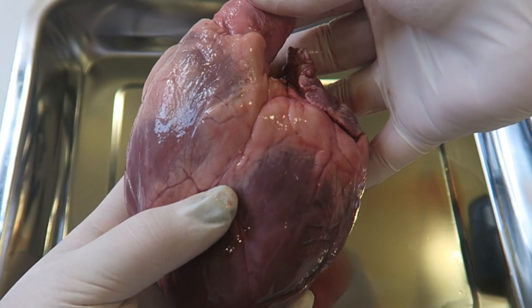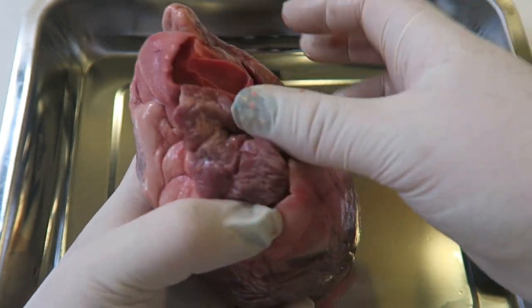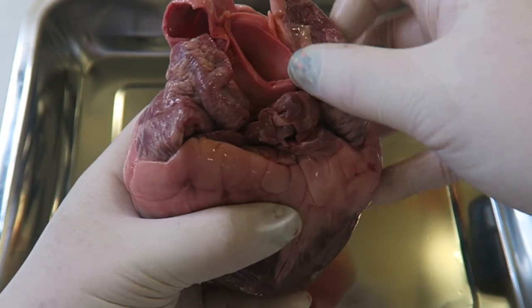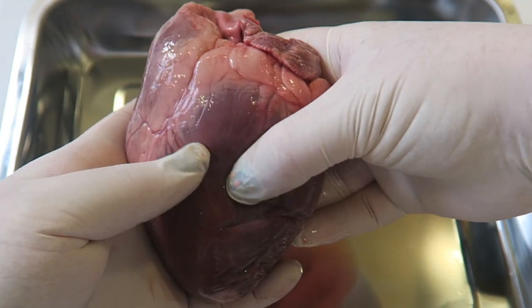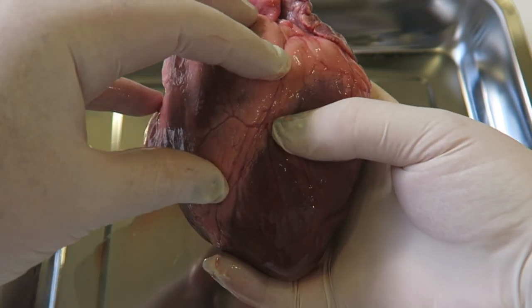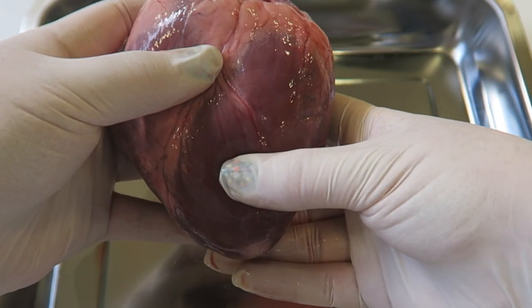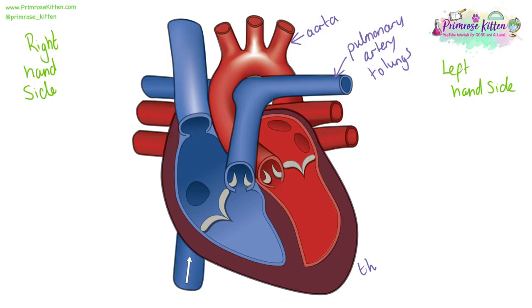Comes out on the right side. This must be the pulmonary artery going up to the lungs. We can see it's slightly thinner, whereas this one's got much thicker walls. And then here, you can see it's coming out down here on the left side. And this is the right side of the heart. You can see it's much smaller than the left side of the heart. This is very thick and very muscly.